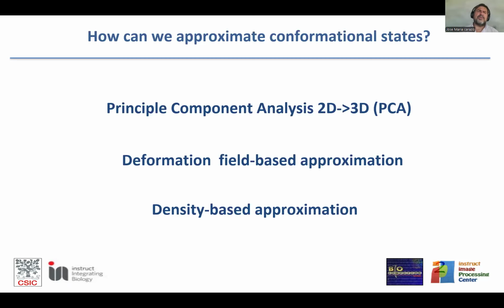Let me present how we approach this, which is also interesting in terms of how in 4 or 5 years this subfield of flexibility has progressed. We started with principal component analysis. Probably all of you know principal component analysis, and you are used to having data of dimensionality n, and in this n-dimensional space, you calculate principal components, and you see the main trends of variability. Perfect. It's not our case.